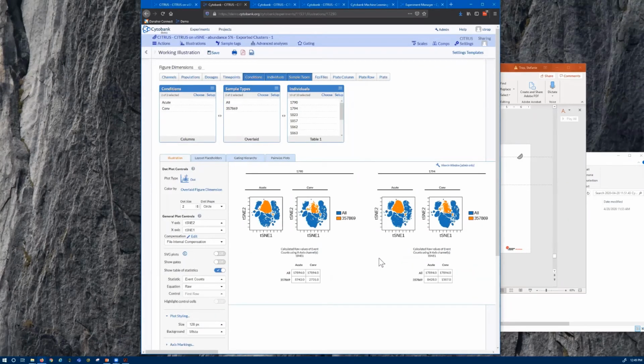It was really easy to see where those events were when looking at all of the events in my sample and compare them side by side visually. So it's not necessary, but I think it gives you a very helpful, clear visualization.